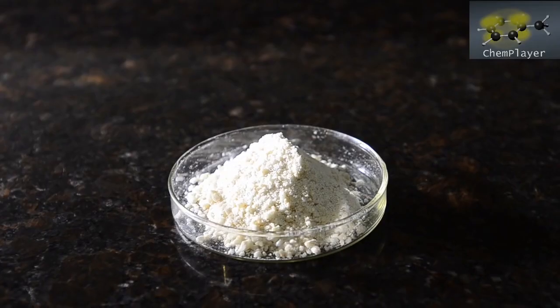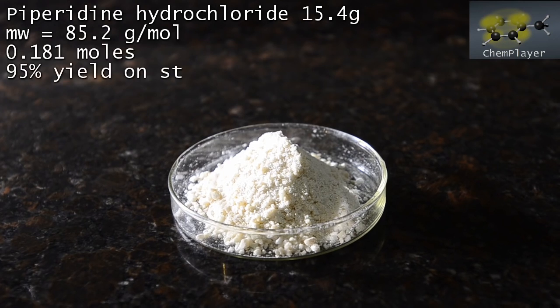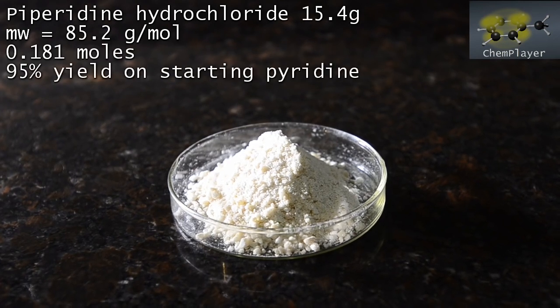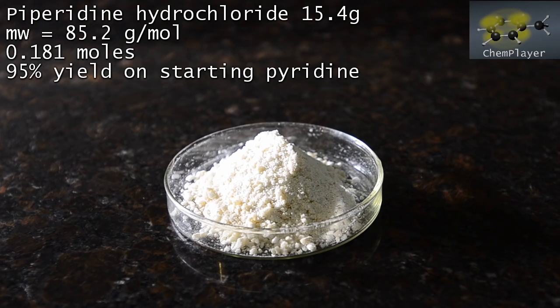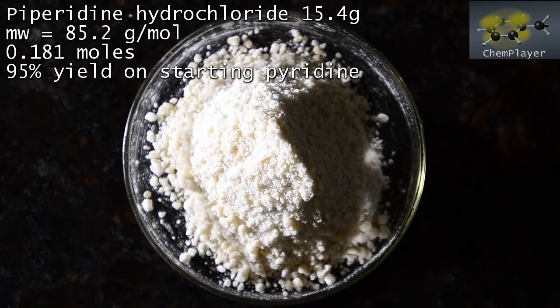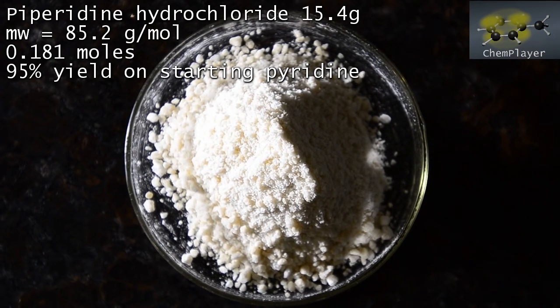After oven drying, here's our product. 15.4 grams of piperidine hydrochloride powder. Well, this corresponds to an amazing 95% yield on starting pyridine, which is a bit too amazing for our liking, so we're sure there must still be some impurity in here. But probably not too much. The color is slightly off-white as you can see, and the pure substance should be white.